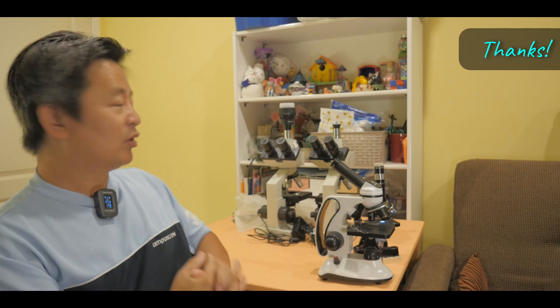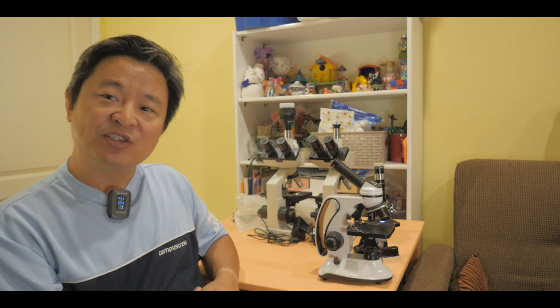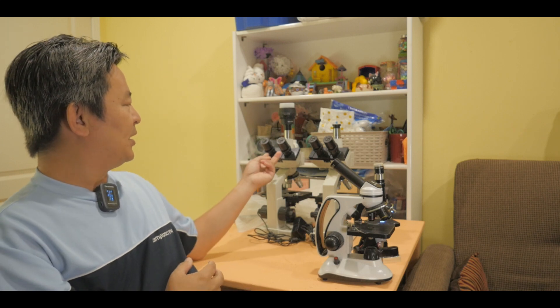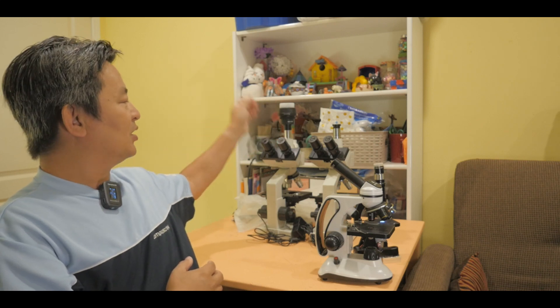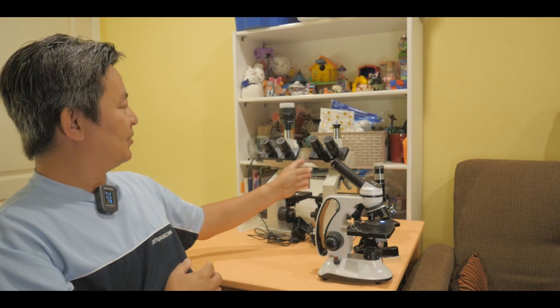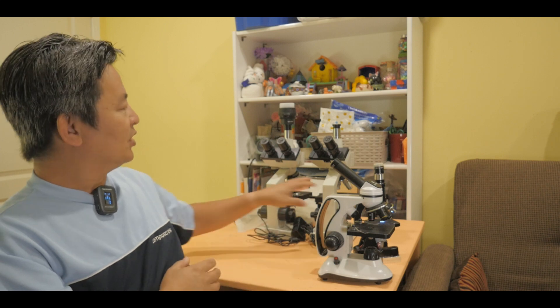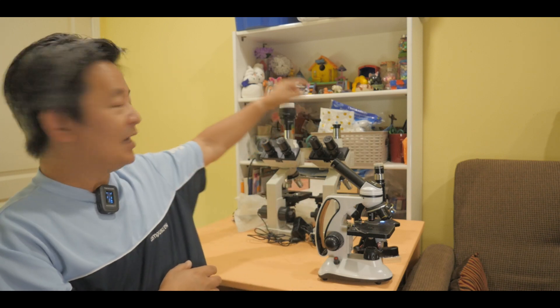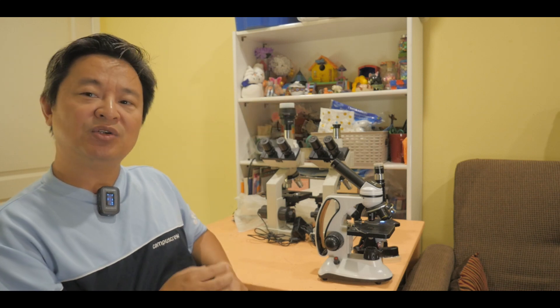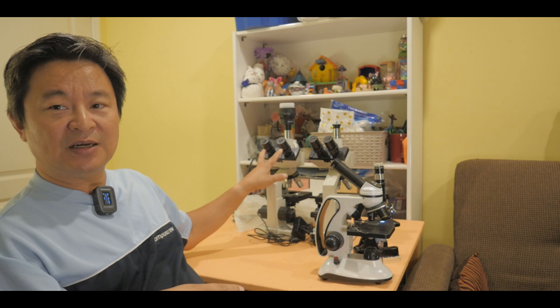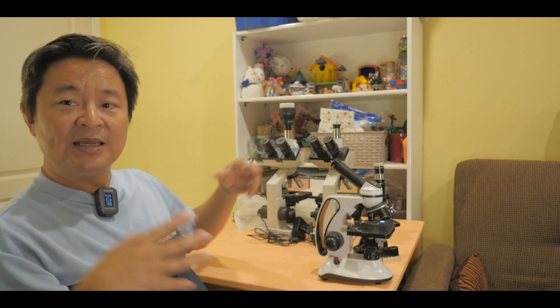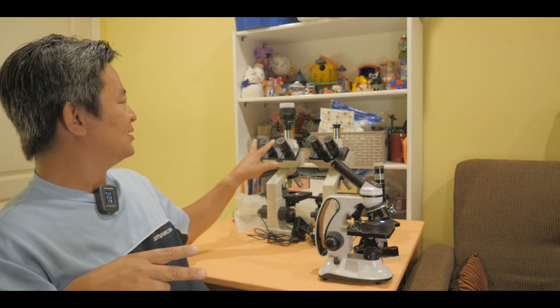Now, of course, if you have the budget, I would go with the type of microscope here. Actually, I have two of them because I like it so much. Now, normally, it's just the binocular type of microscope without this extra ocular tube here. Actually, this one is called triocular microscope. And same thing as this one, this is trinocular microscope, both of them. And the reason why I purchased this trinocular microscope is the fact that it has this tube here, allowing me to put a camera onto it, right? This is great because if you're showing, let's say the class, the image, they can also look at in a big screen as well. Or if you don't want to use these two lens here, these ocular lens, they can actually see almost like a three dimensional structure to the tissue or the cell. So because this is a stereo scope, you can actually see almost like a three dimensional image on the slide. Yeah. I really like these microscope.